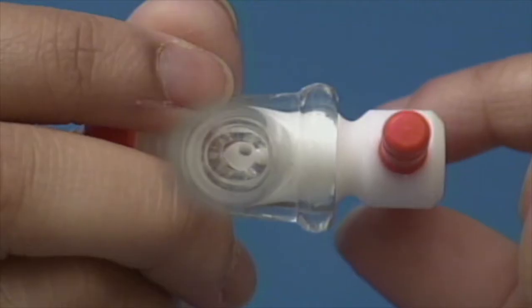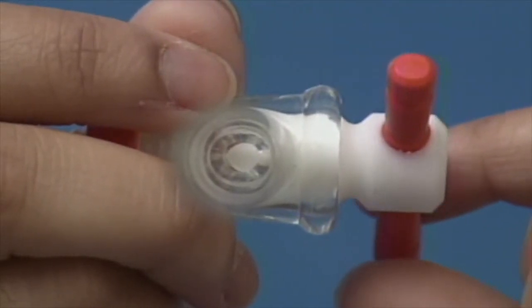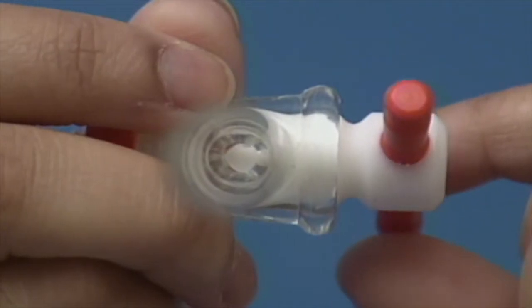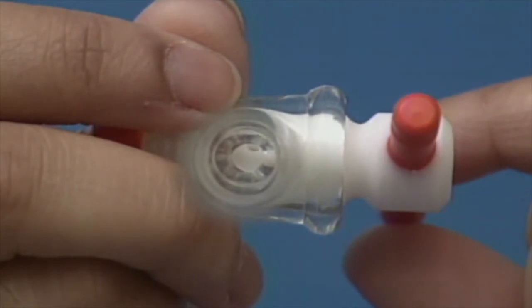The stopcock is the valve that controls the flow of liquid from a burette. As the stopcock handle is turned, the position of the hole in its stem determines how fast the liquid flows.